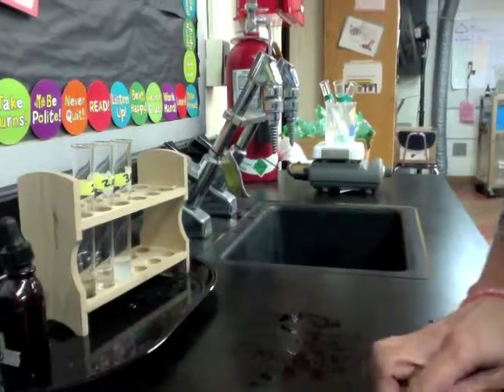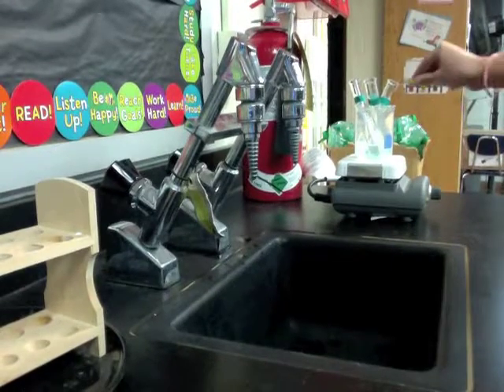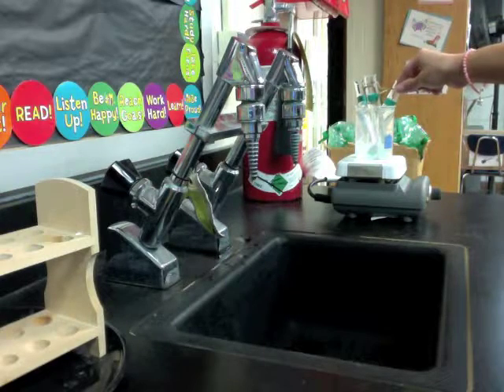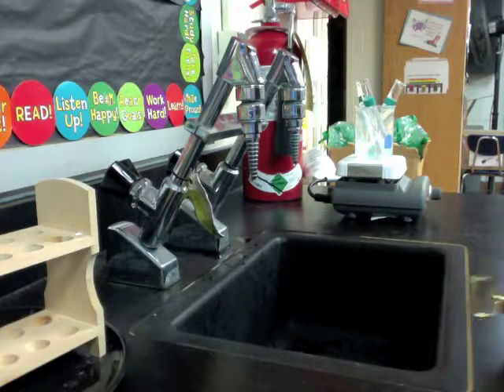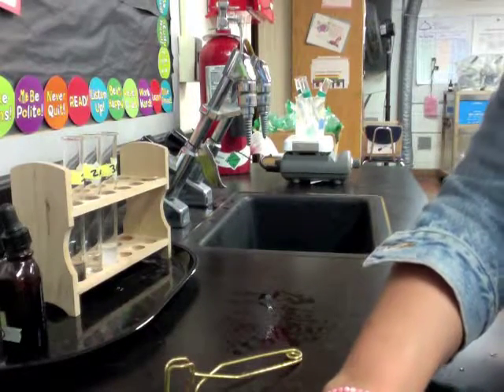Once the test tubes have sat long enough in our hot water bath, what we're going to do is take them out using the test tube holders again, place them back into the test tube rack, and notice any color changes to record in our data table. To clean up, you're going to rinse all six test tubes out in the sink and then return them back to your station.